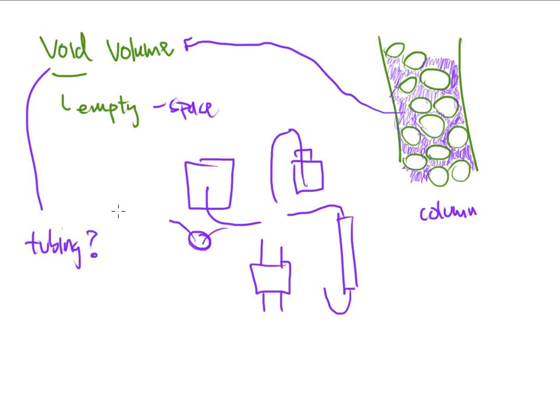That's an issue that I've got to deal with, which is also why retention times can never be textbook, right? I can order the same column in the same instrument for the same lab. The problem, though, is that if I do two different instruments, the length of the tubing in and out of all of these pieces could be slightly different.